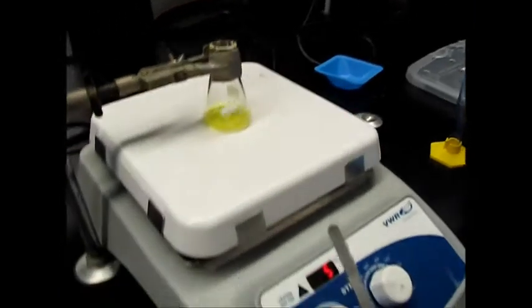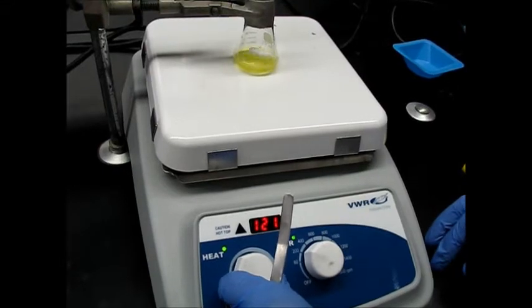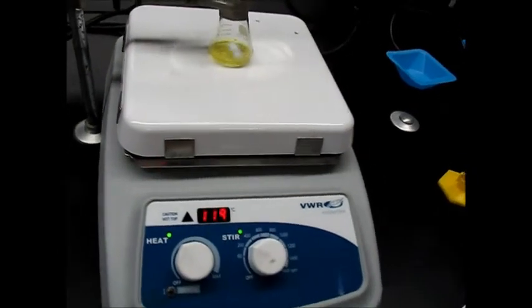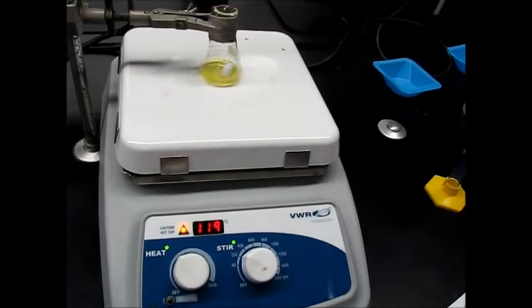Go ahead and turn on the heat. Since we're aiming for around 55 to 60 degrees, we're going to set it to double that, so right at like 120. Cool, that's good. We'll leave it stirring with some heat only for about 3 or 4 minutes. Once we get everything dissolved, we should see a color change from yellow to kind of a white, cloudy, clearish color.